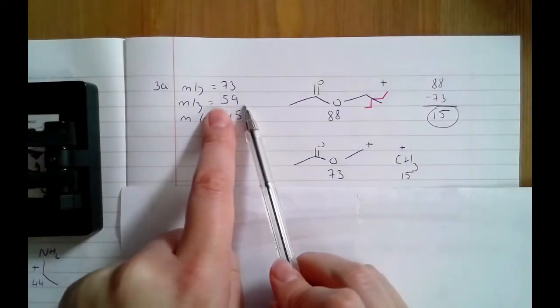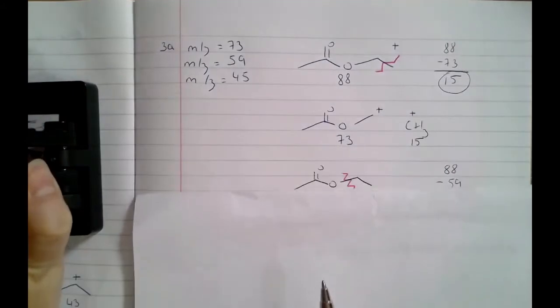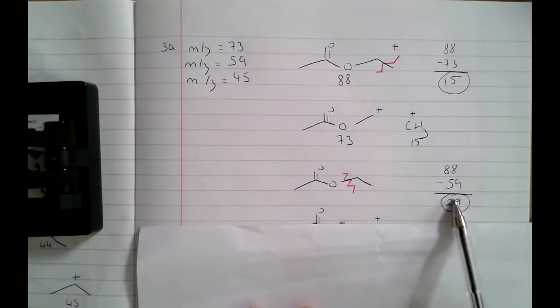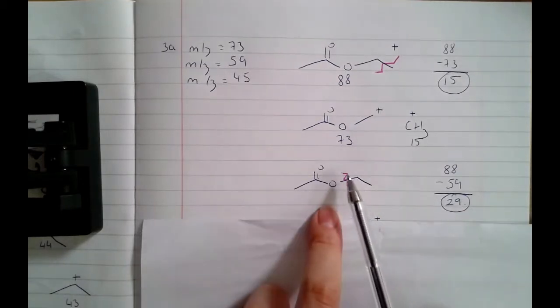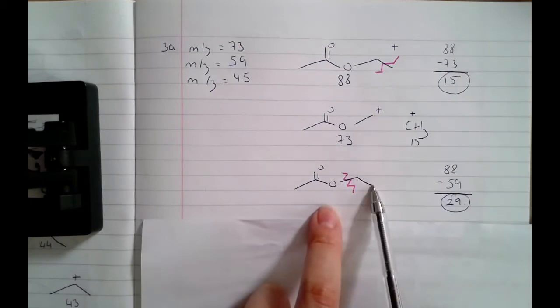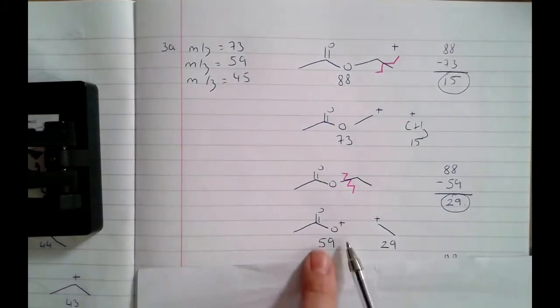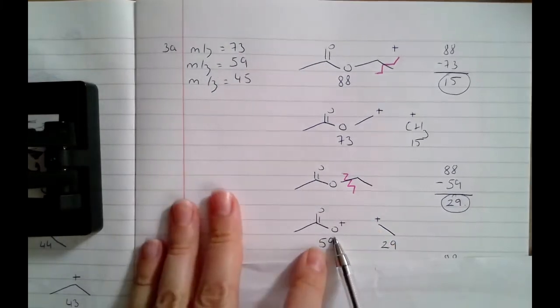The next, again, 59, not a number we're familiar with, so we'll apply the same approach. We'll take the total mass, 88, we'll remove the 59, and we'll see that something was removed that had a mass of 29. A 29 is a number we're familiar with. It's typically C2H5. And if I look at my molecule and break it right here, I can remove 2 carbons and 5 hydrogens, which have a combined mass of 29.